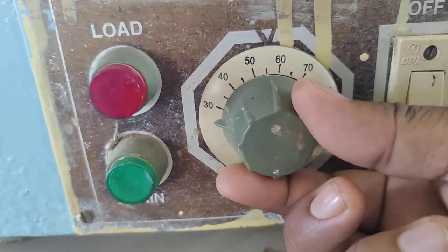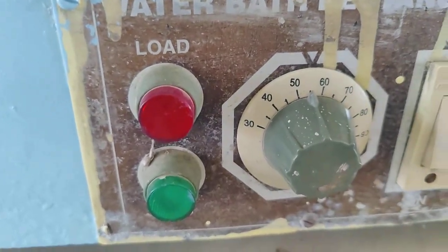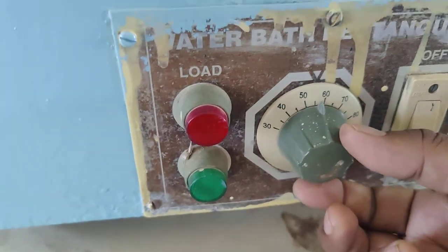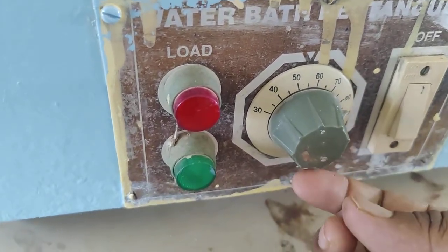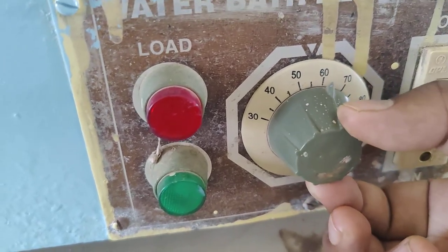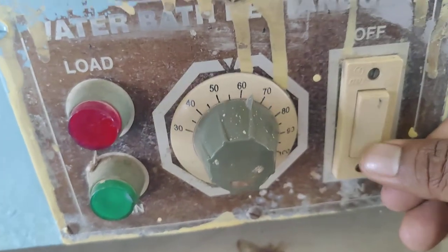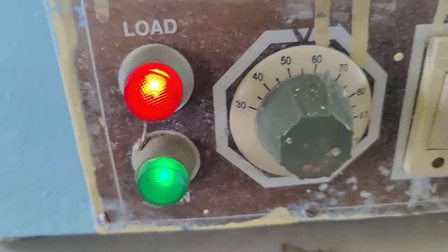The operating functions of this water bath rectangular include two indicators, one on/off switch, and another switch to set the temperature. Whatever temperature we want, we can set it from this knob.